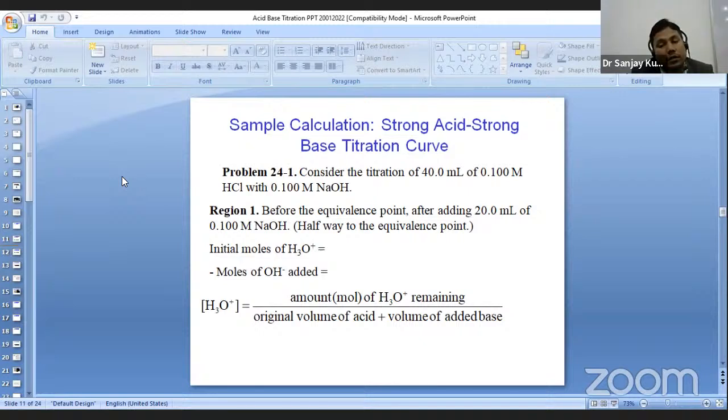So it will reach near about 50%, and then after 40 ml of this solution is added, it leads to neutralization. Neutralization means ultimately the color changes, and with the color change we can conclude that we have found the endpoint.